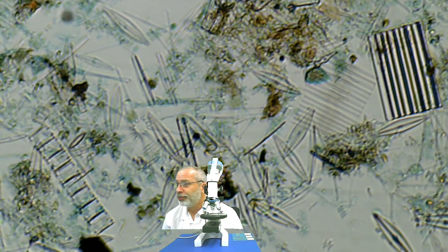But at this 40 times magnification, take a little while and try to distinguish the different species and draw to the best of your ability some of the ones that you see, paying particular attention not to the smudged areas, which might actually be some algae, but rather paying attention to the parts where you see some geometric shapes. Those are the diatoms themselves.